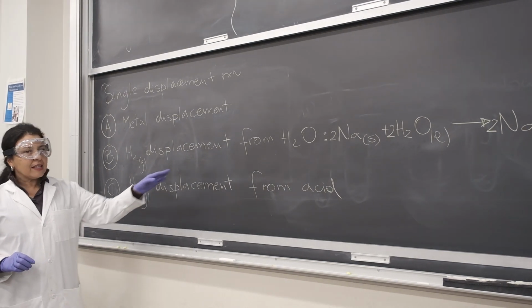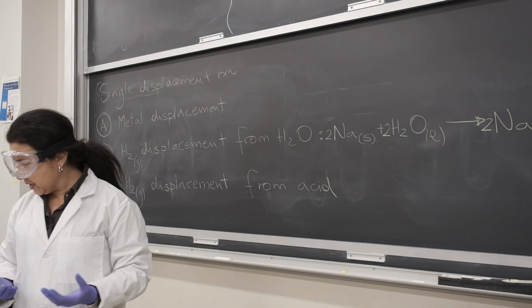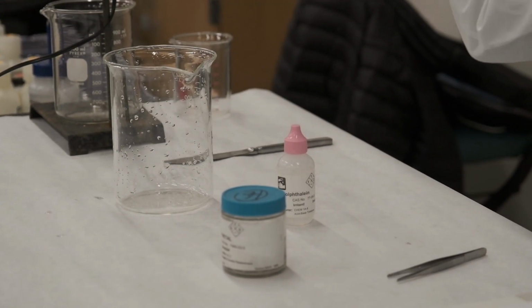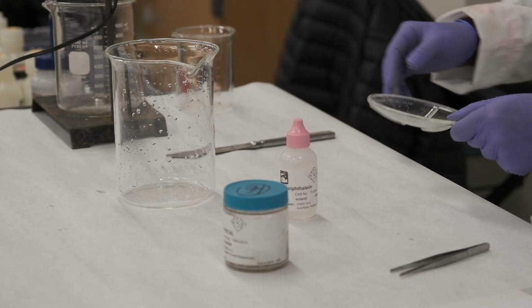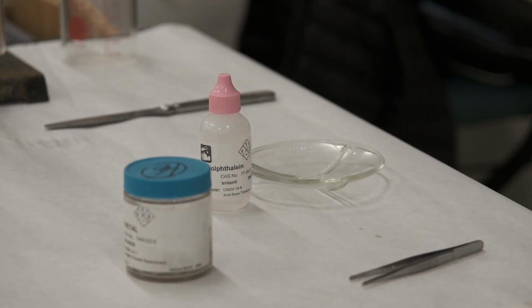So let's perform this first reaction that you're not going to perform for safety reasons, and that I am performing. Hopefully the goggles will protect me enough. So I don't know where I put them. Okay, so we have a watch glass. Let me fill this with water. One second.